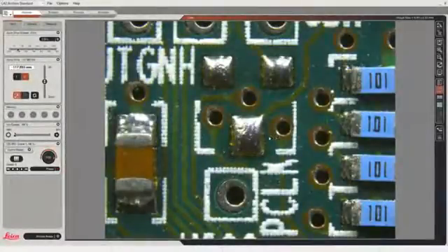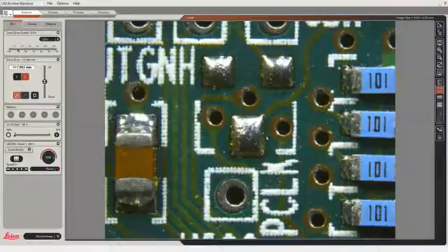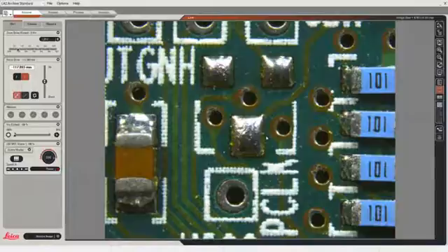In this video, we're going to adjust the microscope to give us that great image that we want to see and capture. We're connected to a Leica M165C stereo microscope.